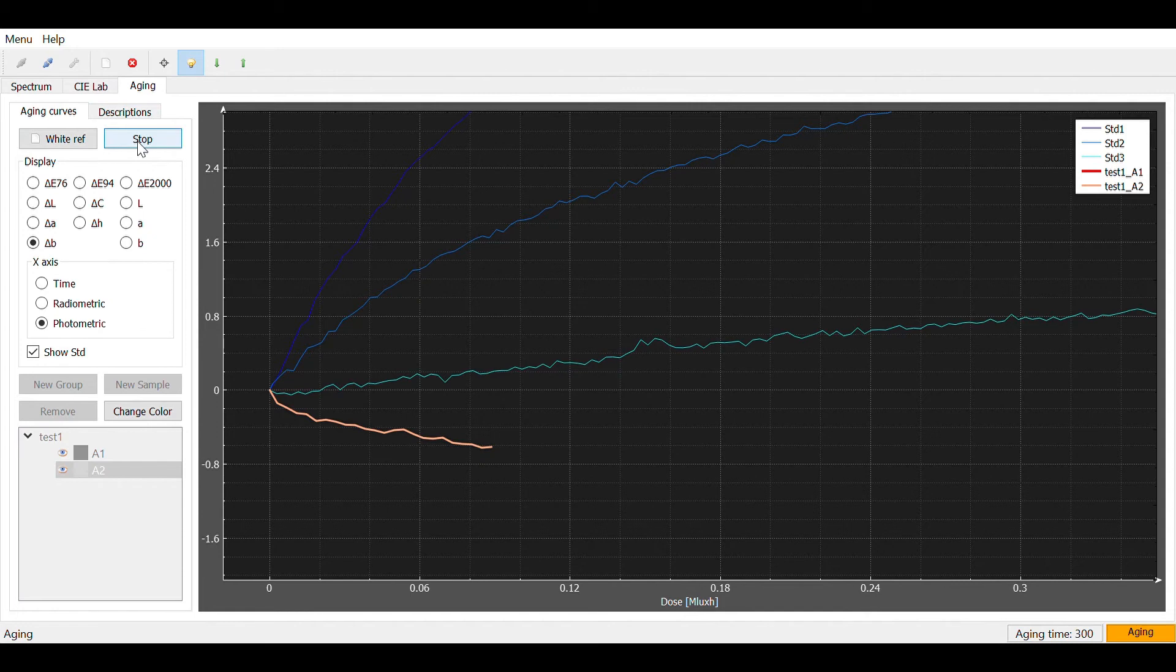The results for multiple spots are listed in one graph to be easily compared to one another and to the BlueWool standards.